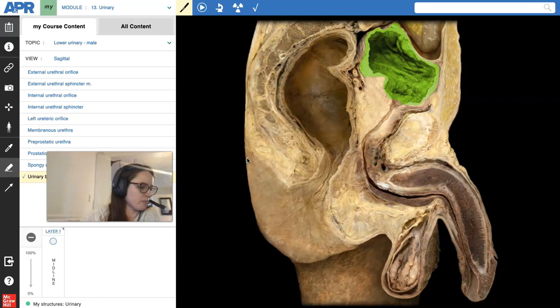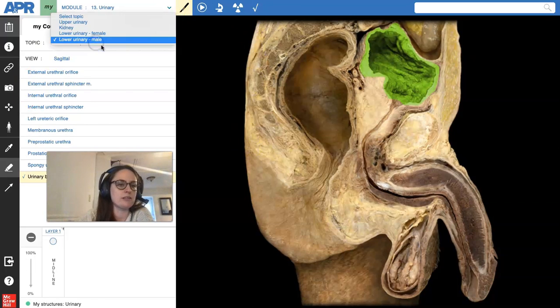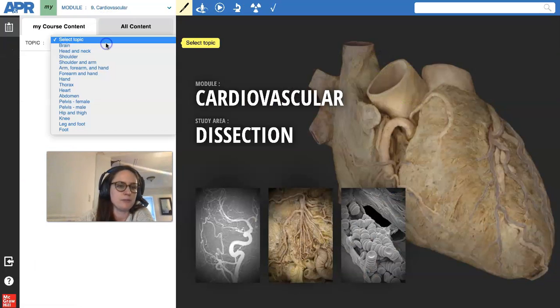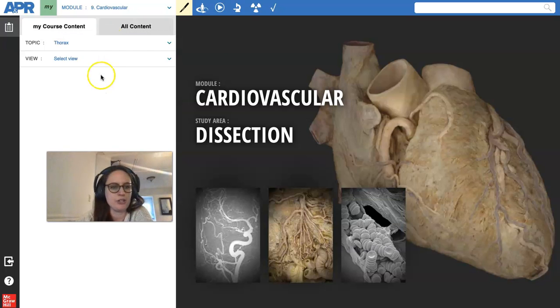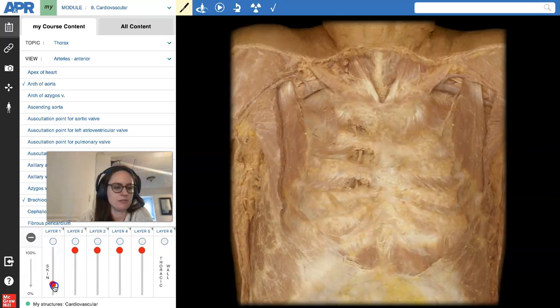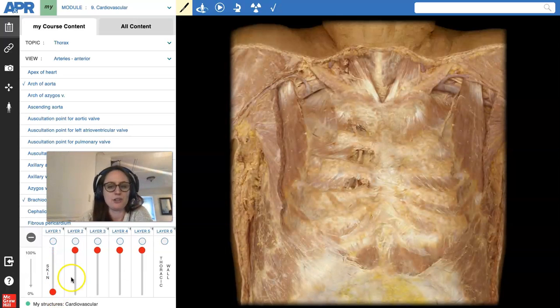Okay. Cardiovascular structures, of which we've already got a couple. We've got renal arteries and veins. So, cardiovascular. Let's go ahead and start with the thoracic view in general. Now, this is where we do that classic Y incision that everybody knows something about from lots of medical dramas and CSI type things. So we get rid of the skin of the superficial body wall.